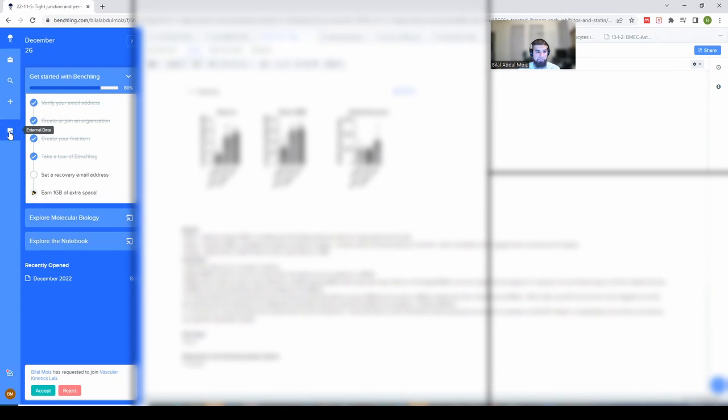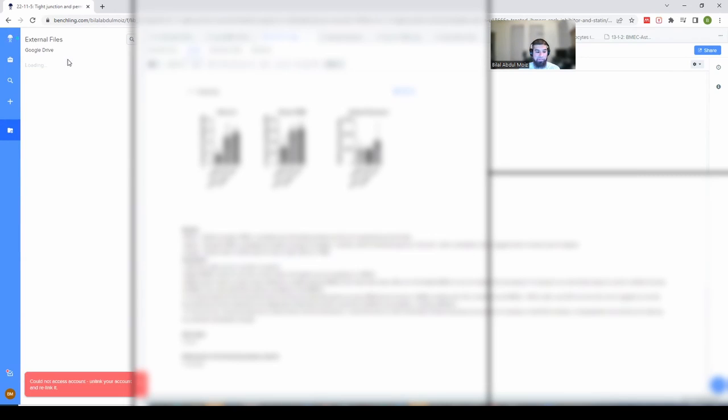Another feature is the external data tab where you can connect to your Google Drive — once linked, you can drag files directly from there into your lab book, which is really convenient especially if you take pictures. For project organization, I have a number of folders each designating a specific project topic — for example, barrier function and endothelial cells in one folder, drug delivery experiments in another — and each experimental replicate is contained within those folders.